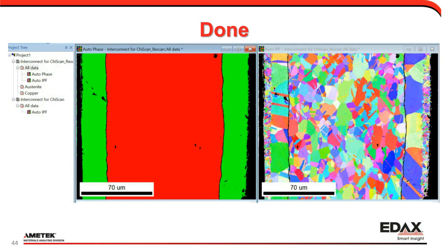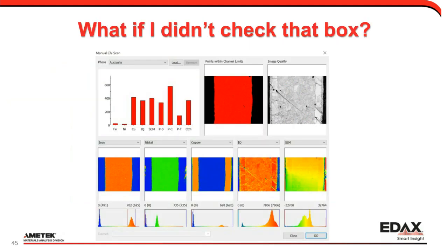Now, here is where we talk slightly about the other method. Actually, it looks like I would have had a little bit more time than I thought, and I could have probably expanded on this. So I'll go ahead and talk a little bit about this.